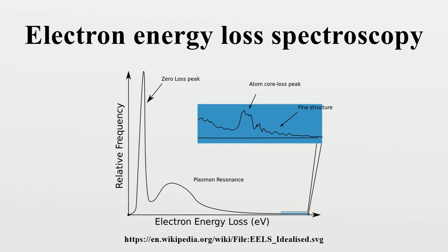scattering. History. The technique was developed by James Hillier and R. F. Baker in the mid-1940s but was not widely used over the next 50 years, only becoming more widespread in research in the 1990s due to advances in microscope instrumentation and vacuum technology. With modern instrumentation becoming widely available in laboratories worldwide, the technical and scientific developments from the mid-1990s have been rapid.